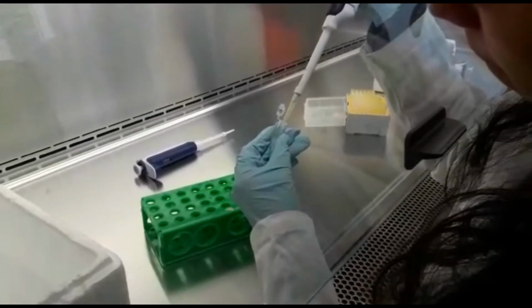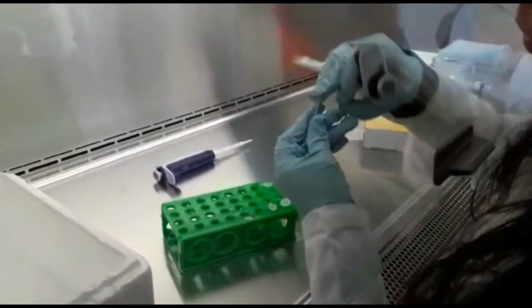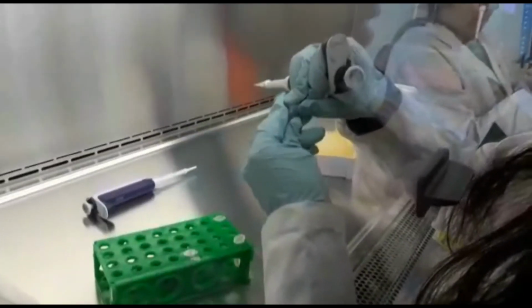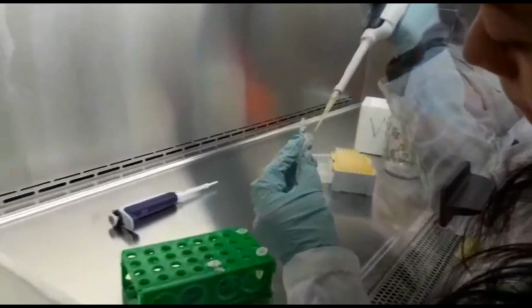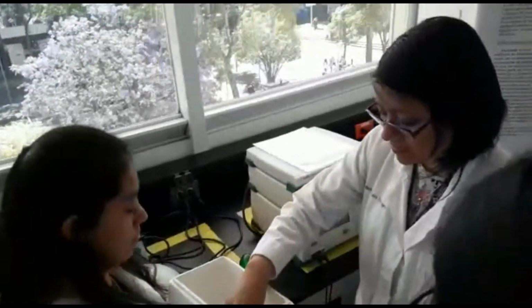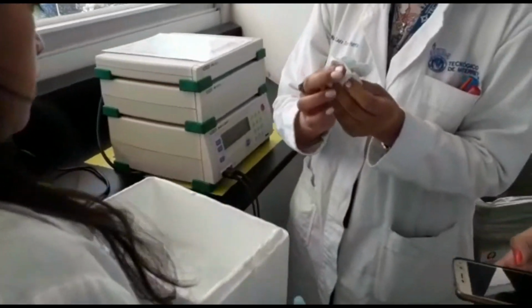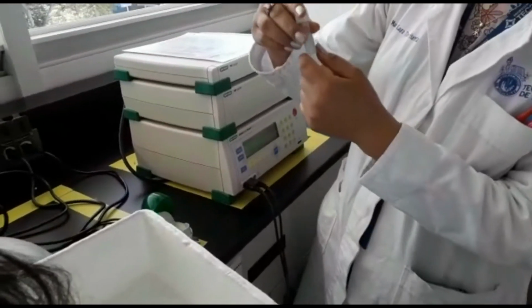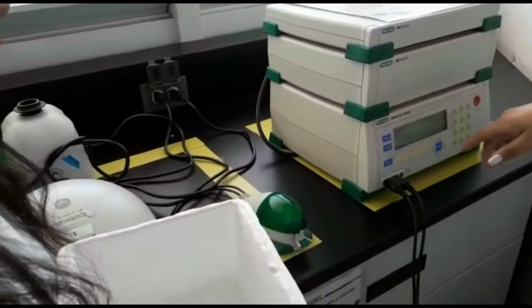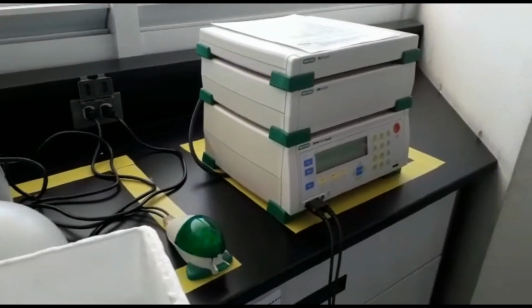First, we have to thaw the PCR product on ice, as well as the reagents of the kit in ice. Then we have to prepare the ligation reaction for chemical transformation or electroporation, depending on the cell we have chosen from the last practice. We have to save the ligation at minus 20 degrees. We have to transform using 3 microliters of ligation into 50 microliters of chemicompetent or electrocompetent cells.